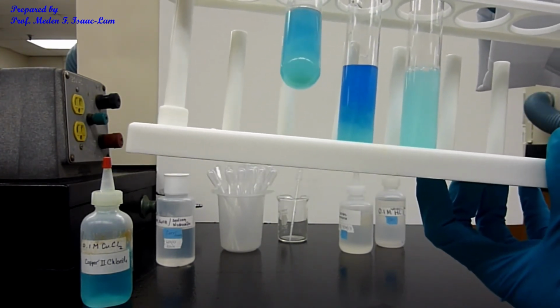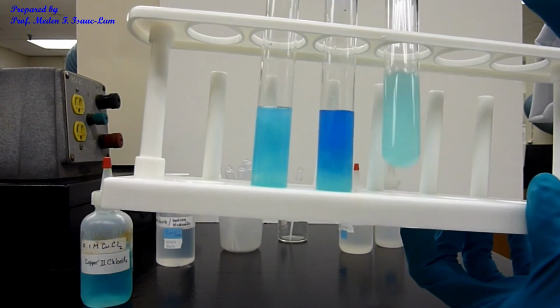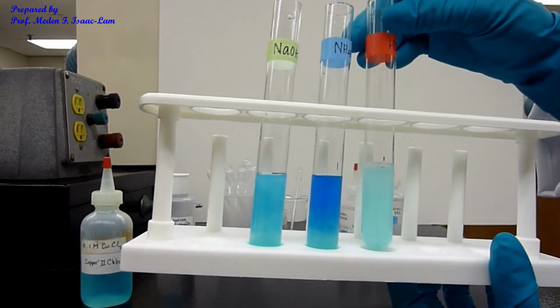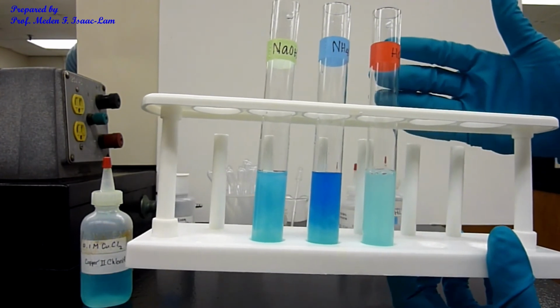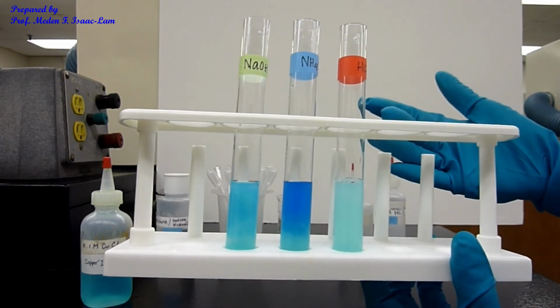So adding a base will make it precipitate more, while adding an acid will make it precipitate less. So that's the effect of adding certain reactants in the equilibrium of the reaction for a reversible reaction.